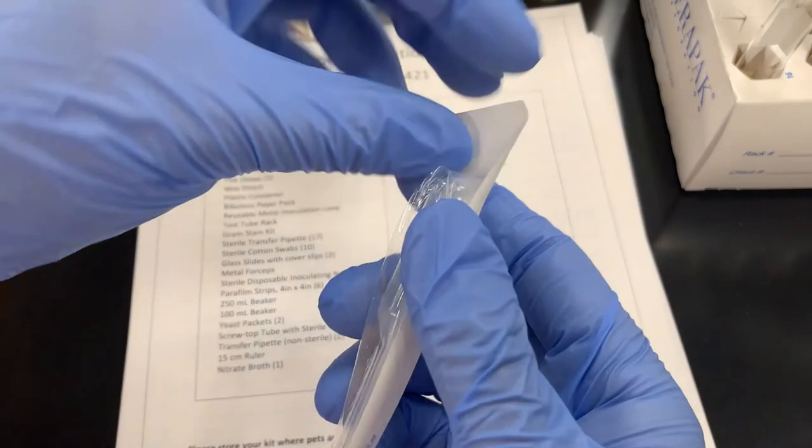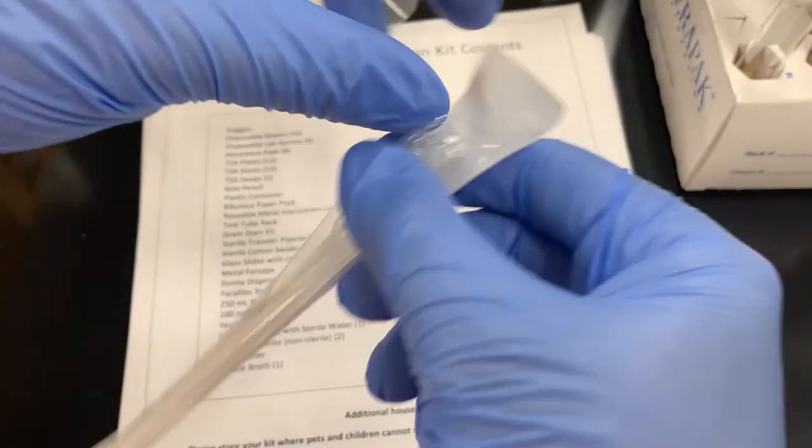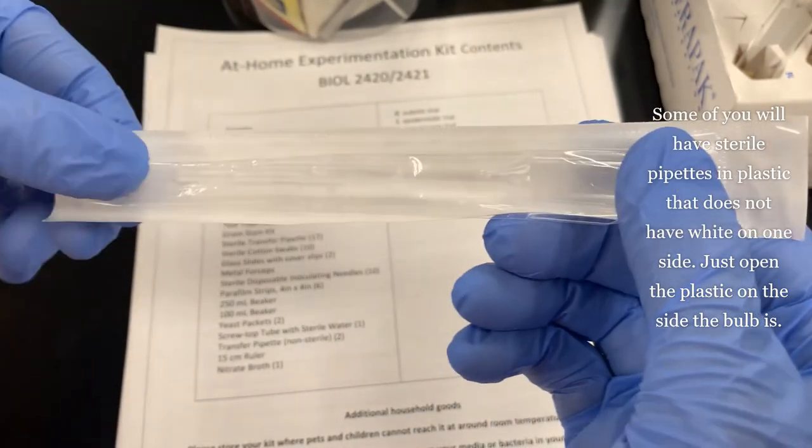They come in a little package. They have tabs at the top. One is clear, the other is white. Okay, you open that. You can grab the bulb. Do not touch down here. Do not make it unsterile.